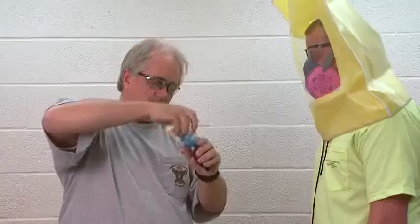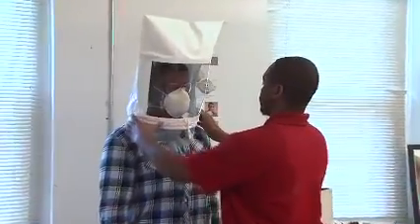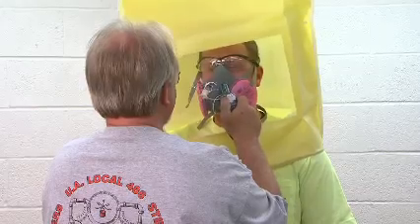Qualitative fit testing is normally used for half-mask respirators — those that just cover your mouth and nose. Half-mask respirators can be filtering face piece respirators, often called N95s, as well as elastomeric respirators.